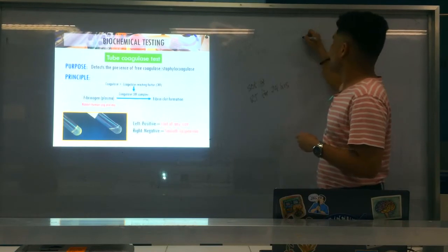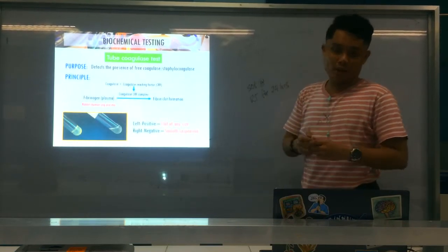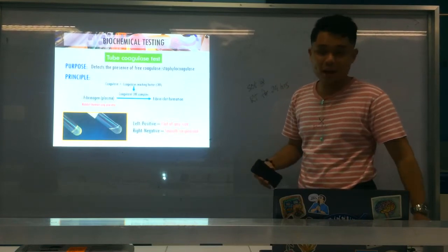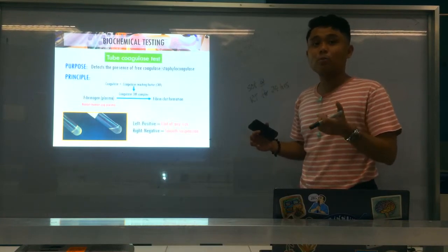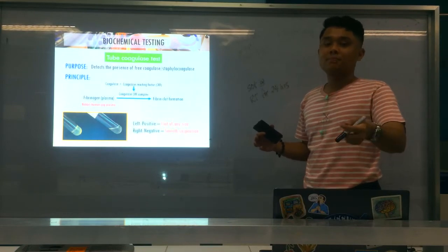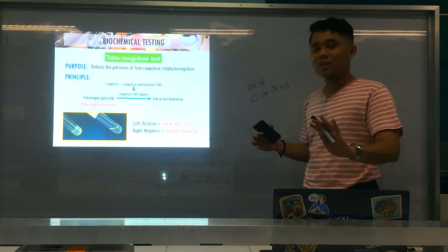Okay? By the name itself, lysine, fibrino, so yung i-lyse ang fibrin clot, okay? And mas ma-activate daw siya at 37 degrees Celsius. That is why, after 4 hours, if wala pa gihapon clot, tangtango na siya sa incubator and let it stay at room temperature for 24 hours. And then i-check na po siya after 24 hours, alright? Okay, so again, within 4 hours lang siya.